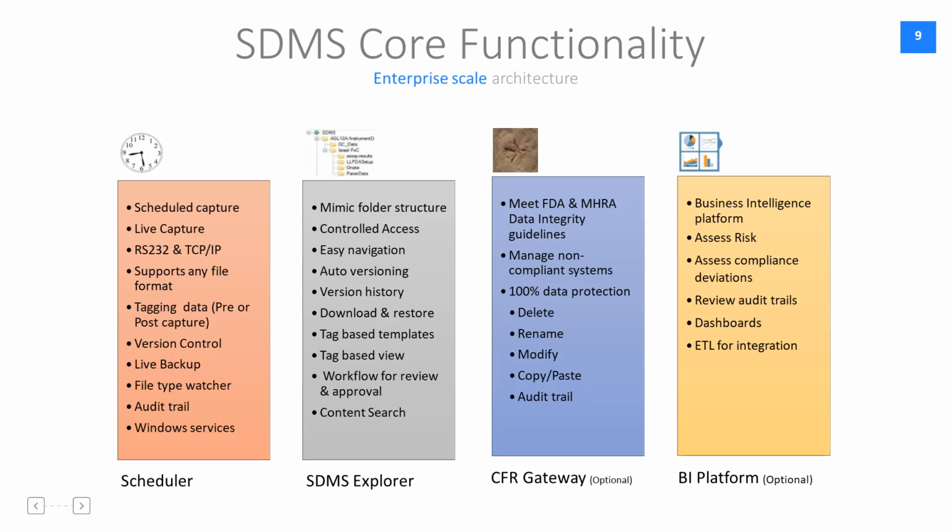CFR Gateway is a very important tool, very unique tool developed by Agram Technologies. There are many instruments out there in several laboratories across the world which do not have appropriate access controls, CFR Part 11 related controls. How to handle such instruments?